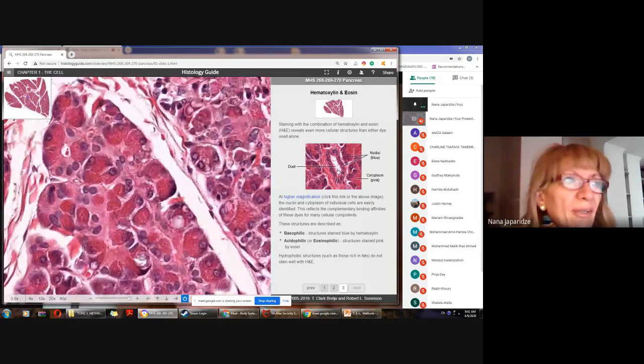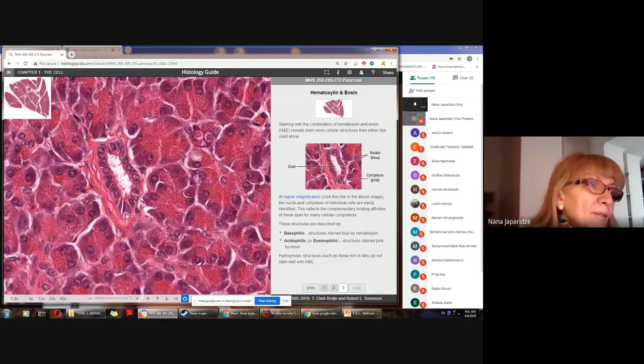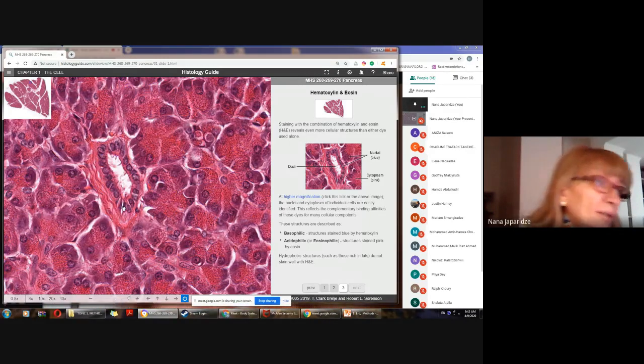Okay, I will click directly on this image and you will see. Look, epithelial cells which line the wall of the duct, lumen of the duct, very well visible nucleus, nucleolus also clearly identifiable, chromatin, hetero and euchromatin. And plus you can see here also cell borders very well.